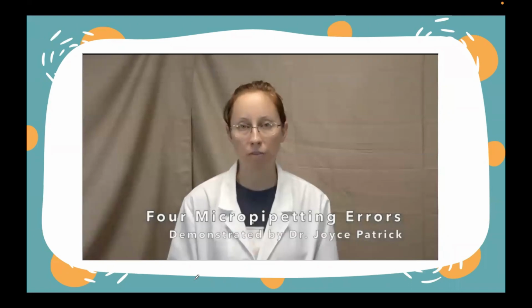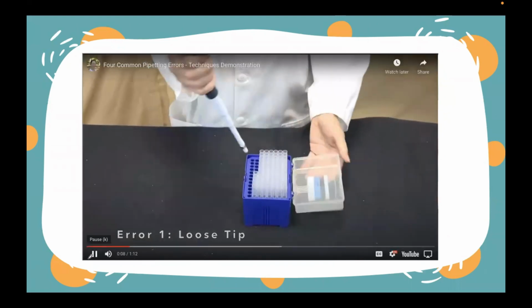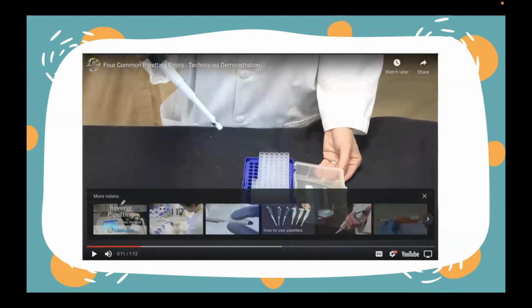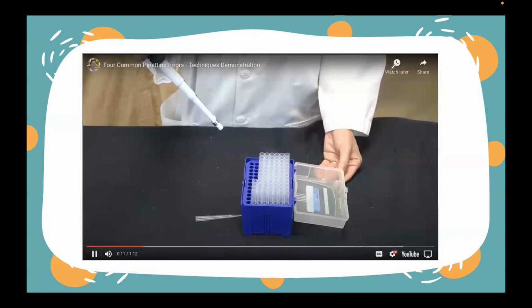Here are some things to be aware of when pipetting. The first is not putting the pipette tip on firmly enough. Ayan. So, sabi nga po dun sa tinuro natin kanina, hindi naman masyadong madiin, hindi din dapat masyadong light lang yung pagkaka-press, yung pagkaka-contact mo between sa pipette mo and pipette tips mo. Kasi ang tendency, magkakaroon ka ng loose pipette tip, so malalaglag siya, madumi na, hindi mo na pwedeng gamitin. So, dapat tamang pressure lang para mag-attach yung iyong pipette tips to your micropipette. So it easily falls off your pipetter.